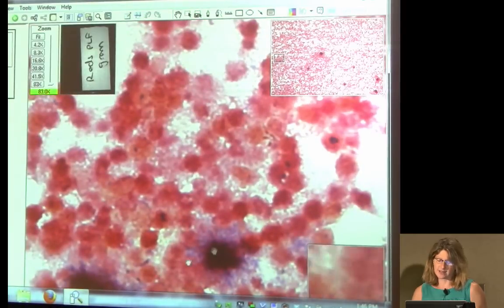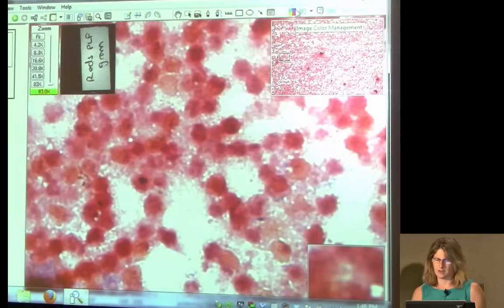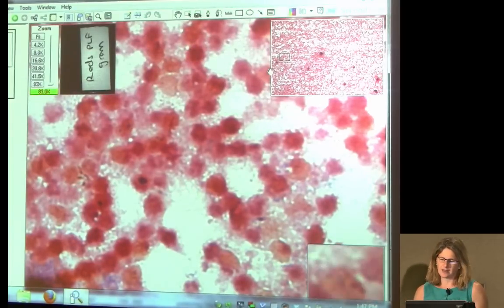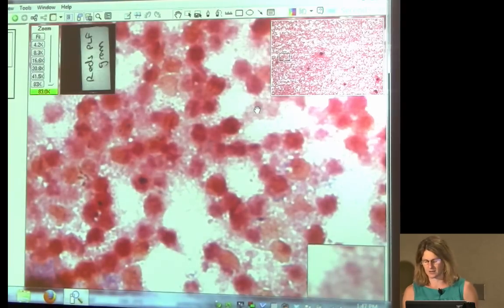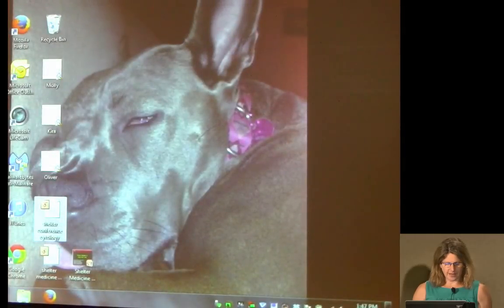And my policy on any suppurative inflammatory reaction is to gram stain everything in case you miss something, because cocci can mimic ruptured cells, and ruptured nucleus streaming can mimic bacteria, and it's always good to gram stain things. And gram staining for me is really more of a hunt for gram positives, because they're going to pop out like these, and less for gram negatives, because you can imagine gram negatives in any gram stain. You really can. So I use the regular stain, the Diff-Quik or the Wright stain, to pick up gram negative bacteria. So that was that pleural fluid in the cat.